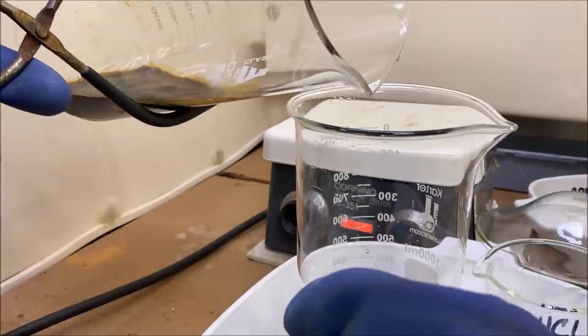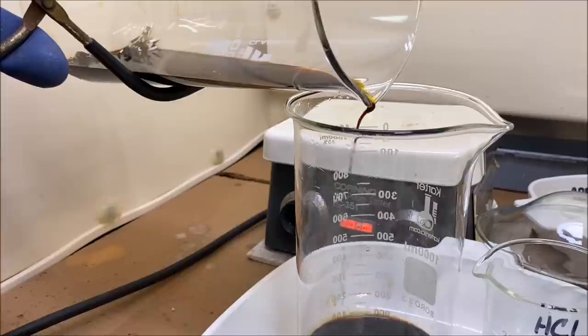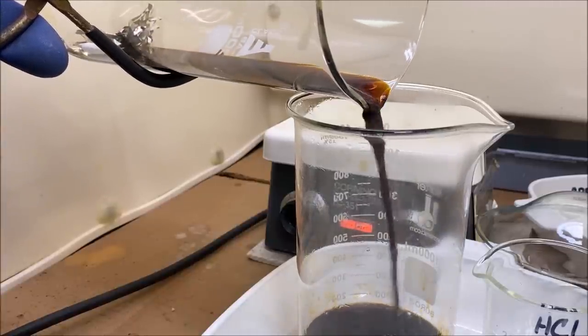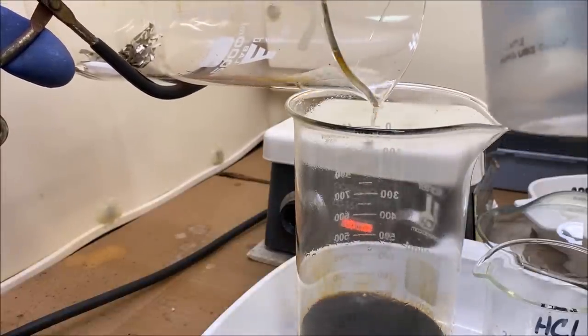When I reach my hands into the fume hood with that platinum fumes going on in there, when I pull my hands back out, I'm bringing some of that fume out into my work area. So I've got a mask on right now. Using a crude setup like this to refine platinum is just not safe.